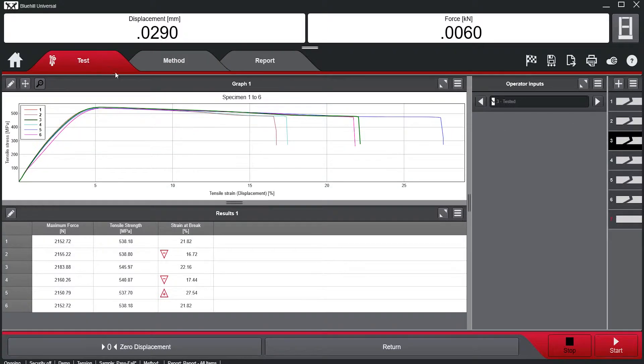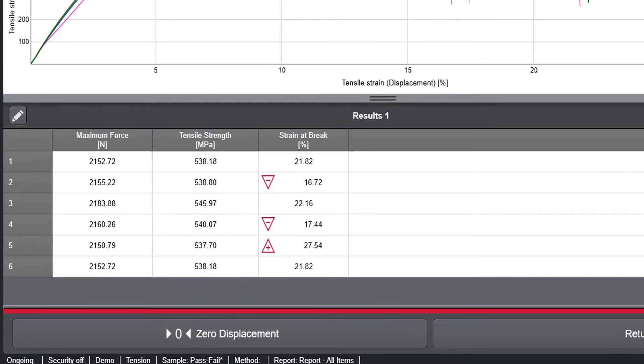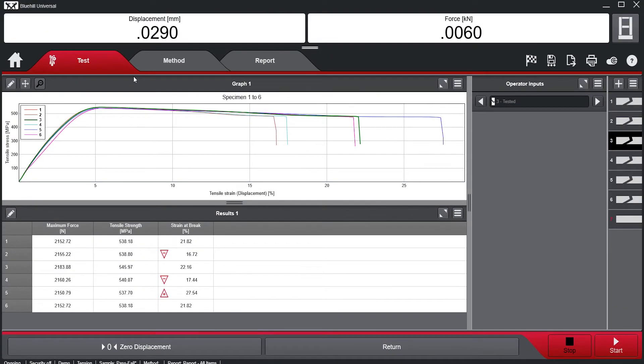Now, navigating back to the Test tab, we can see Blue Hill Universal added indicators of whether a specimen was within specifications or not.